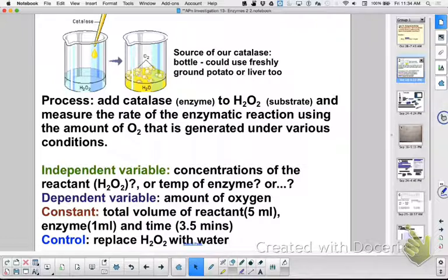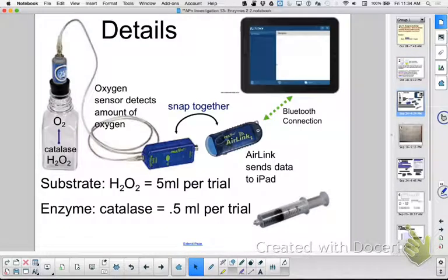So I'm going to model this for you to show you how you do this. But you have these containers right here, okay? And this is station 1's. It probably has something in here from the last class. So if they have any reactant left in there, it could throw off your results. So I would definitely rinse it several times, and then don't make a mess. Don't shake it over the floor, but shake it over the sink and try to get all the water out of it.